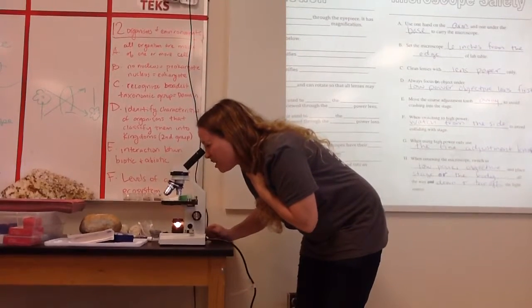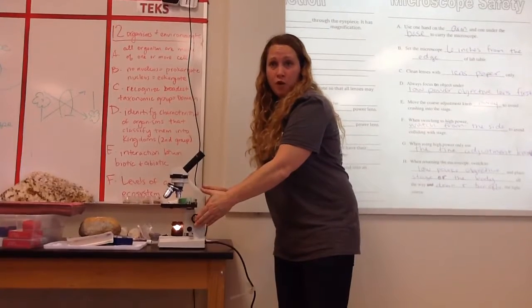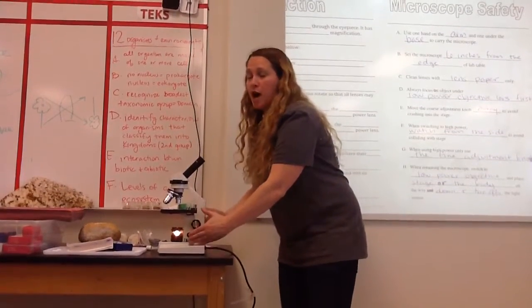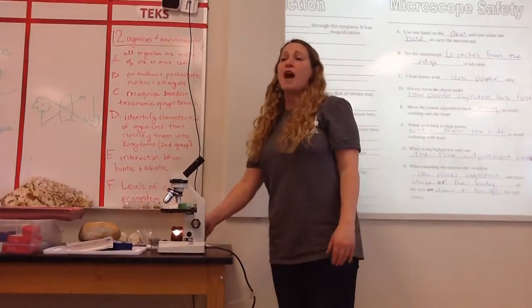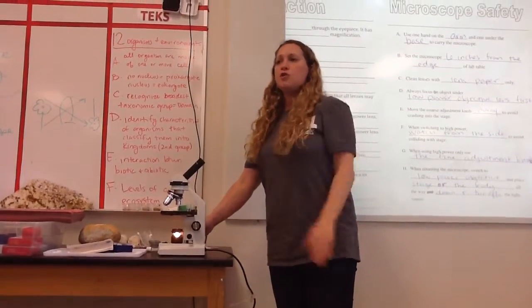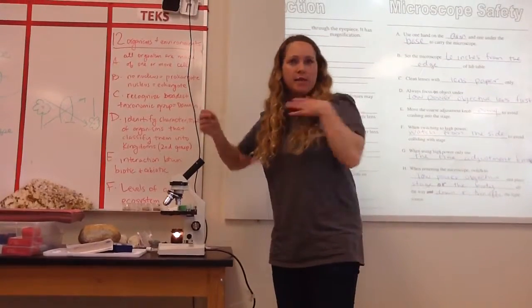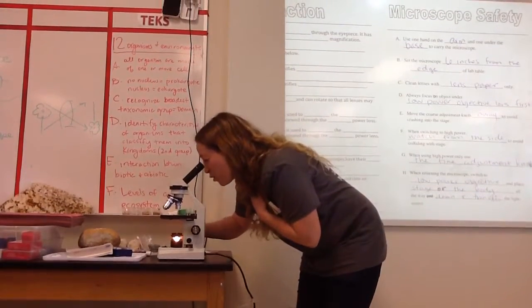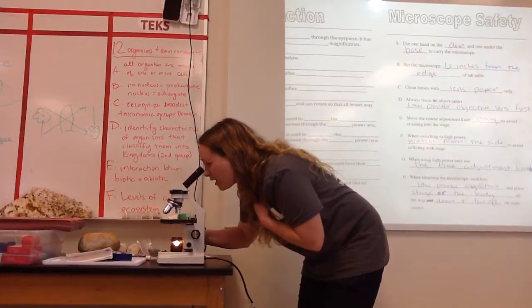When it gets really close to clear, then I'm ready to stop the fat knob, the coarse adjustment knob, and switch to the little knob called the fine adjustment knob. This one puts the finishing touches. On the fine knob, it doesn't move very much, so you can move it forward or back without destroying any slide. Does that make sense? So when we handle the little knob, now I can go forward or back till it's clear. Ooh, it's a pretty cell.